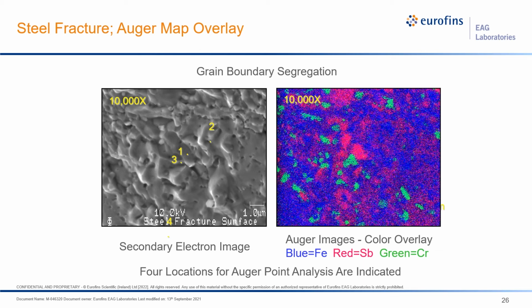And it is troubling to see that there is so much antimony present, which is not a component of steel typically, or not that much. And antimony is a known contributor of embrittlement in stainless steel alloys, and so that explains why this particular piece was prone to fracturing.